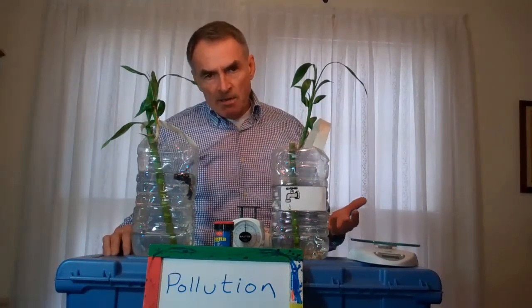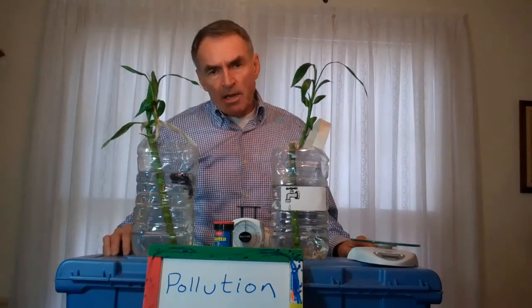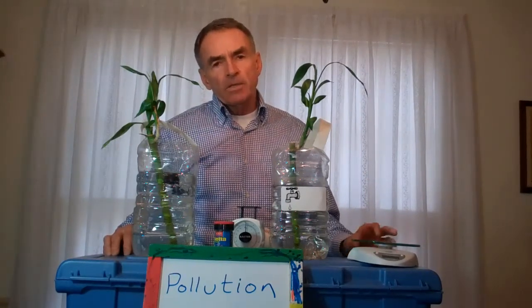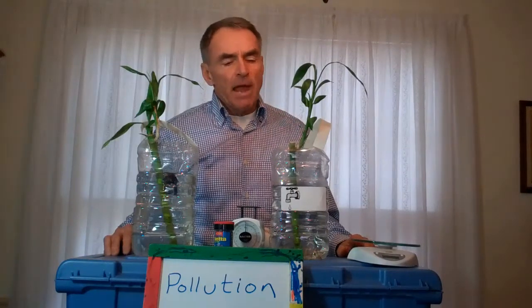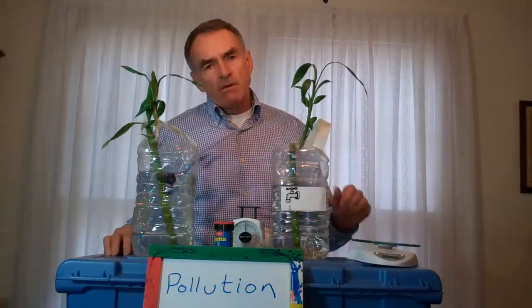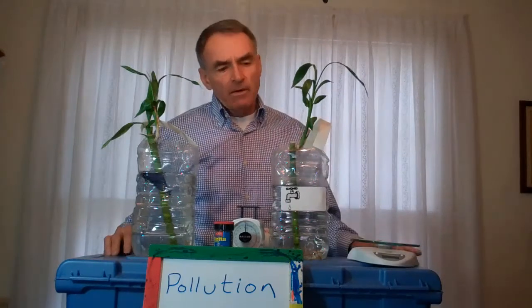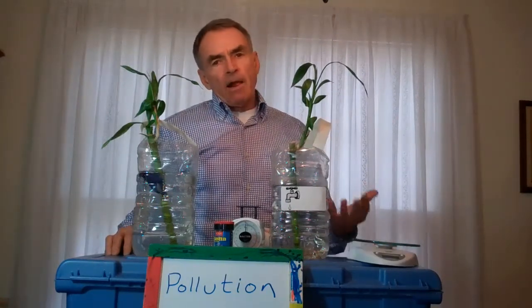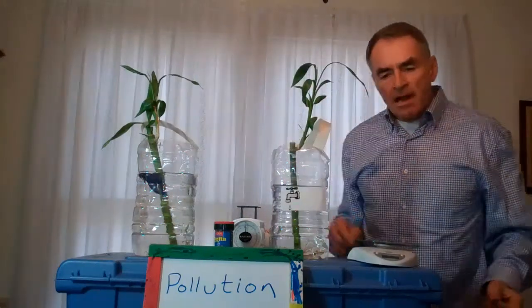It need not be the same group and same plant that the group weighed in the first session, because we're dealing in terms of comparison of change in biomass with the sum of all the weights of the plants from this particular vessel.